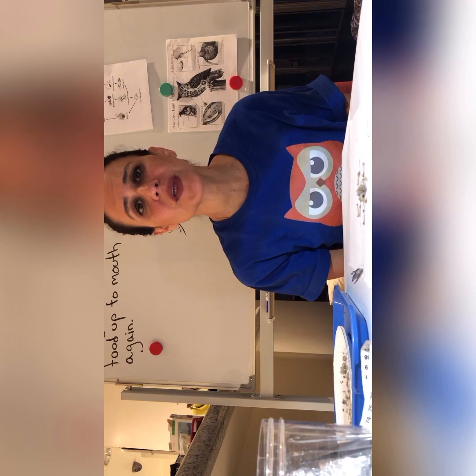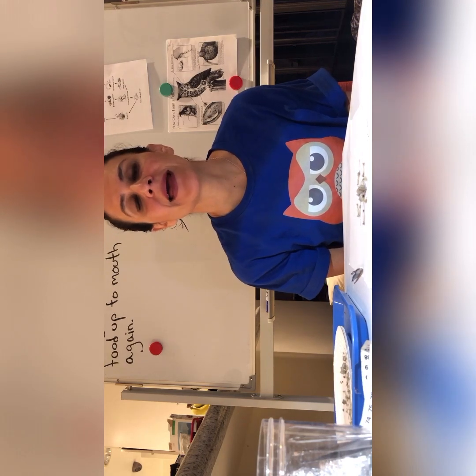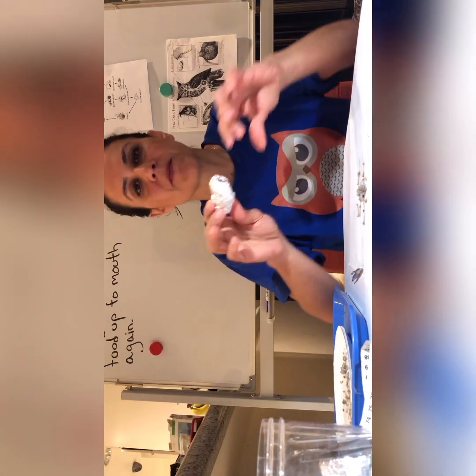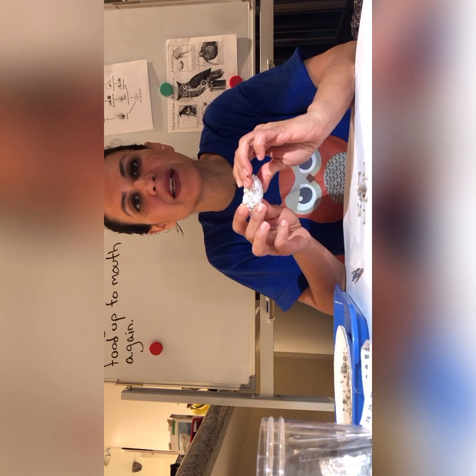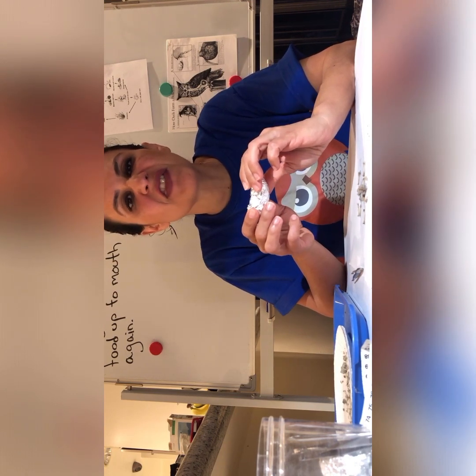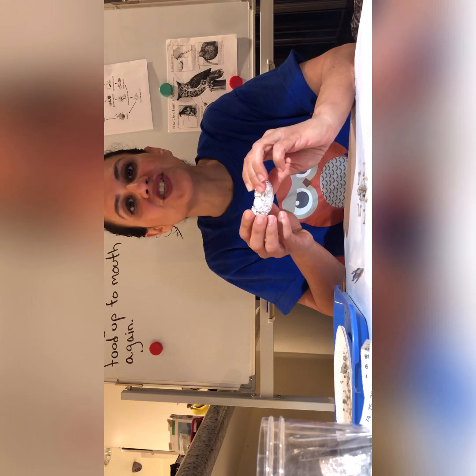So just to recap what we did today, we were learning about owls and the type of food they like to eat and also their digestion, right? We started with an owl pellet, and we learned an owl pellet is what the owl regurgitates, everything that it cannot digest, right?